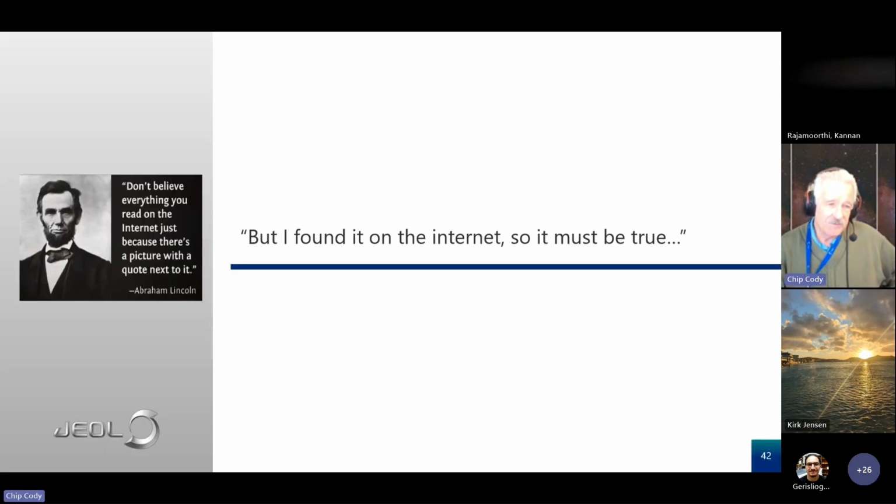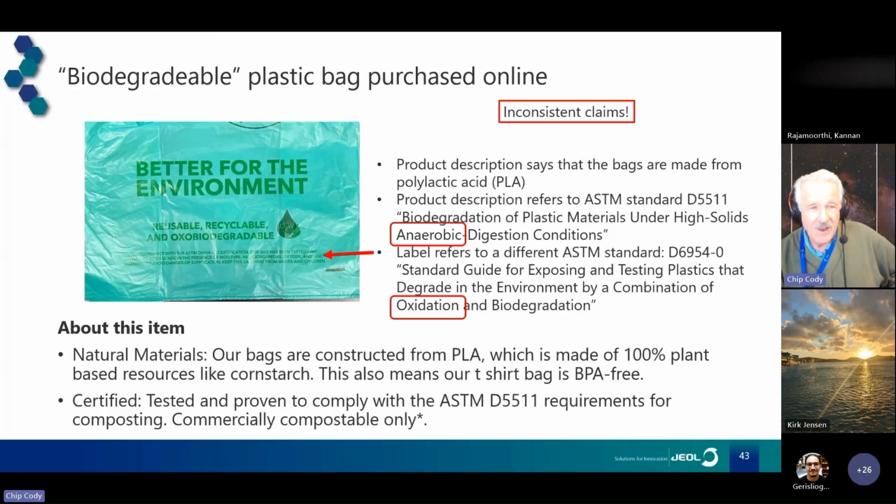Kirk found a fun result in one of the bags that he bought on the internet. So let's show you what happened with that one. This was supposed to be a compostable and biodegradable plastic bag. Several of them were biodegradable, but this one is inconsistent.